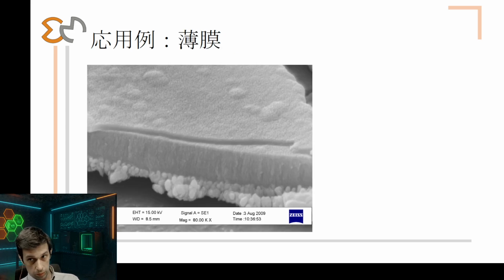This is a double coating. On the bottom there is a coating which is about 1 micron thick, which is of silver, and on the top you can see there is another coating, but this is a cross section, so the coating is broken, right? On the top there is another layer, that layer is about 100 nanometer, so it's extremely thin. Even if it's extremely thin, you see it's very good. There are no defects in the surface. There are some sort of bubbles, but that is not a defect because they're not broken.